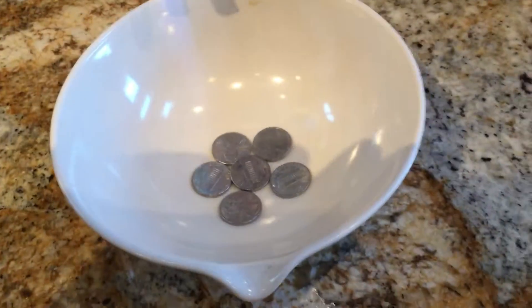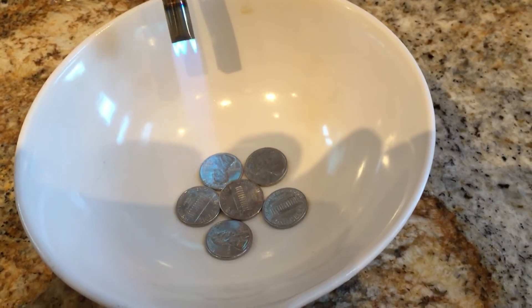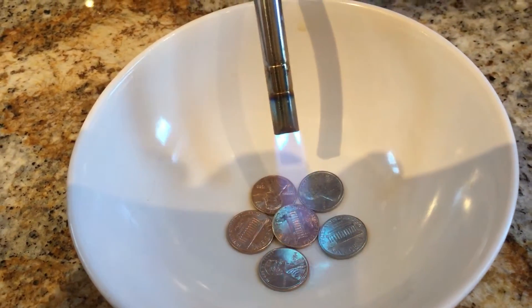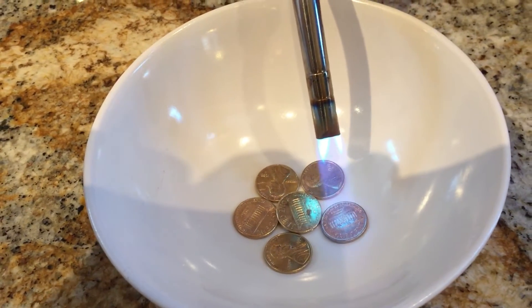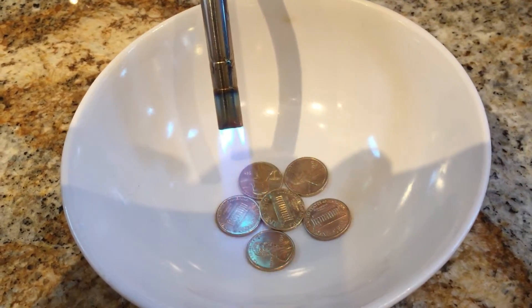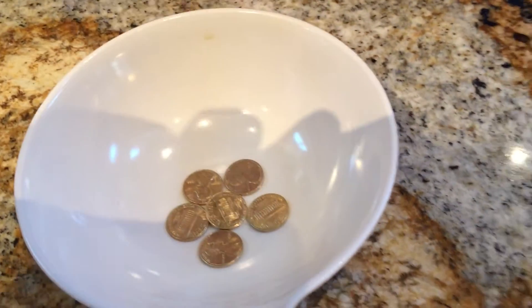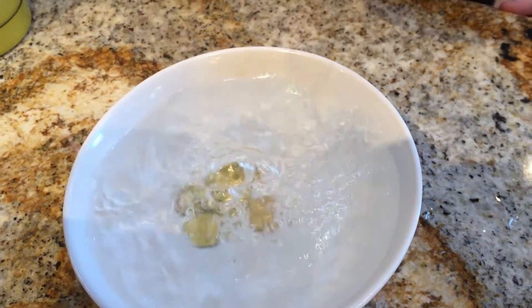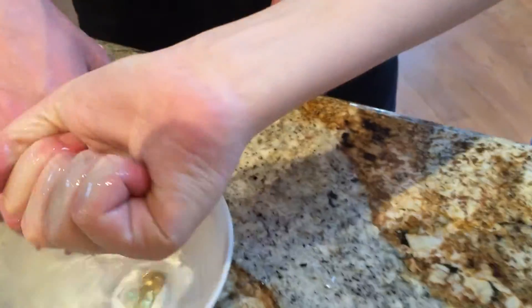All right, here we go. Bam! Golden pennies. I got it. All right, get your golden penny, and see it. Nice. Golden pennies.